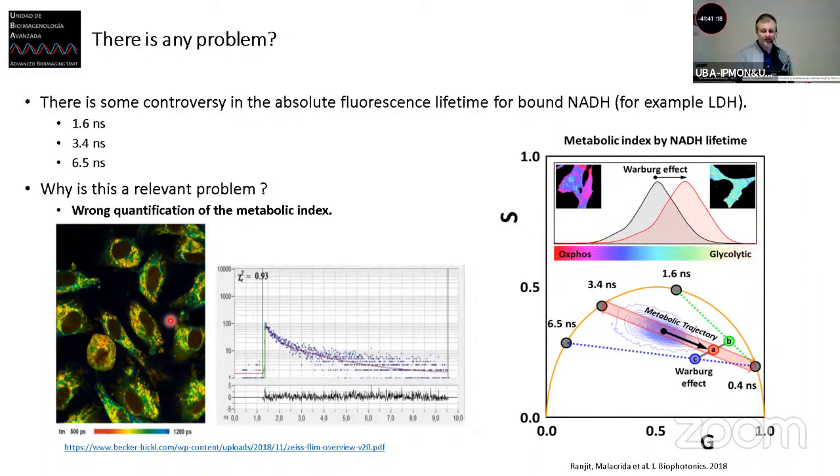And the problem with the time domain is if you collect data and you cut data, because you conceive the measurement from the point of the pulse to the arrival of the photon, but not in the period of the laser, you chop the data. And if you chop the data, when you transform the data in the Phasor, you can screw up the measurement, because you can overestimate or underestimate the amount of free or bound, particularly bound, because it's the long lifetime, right?